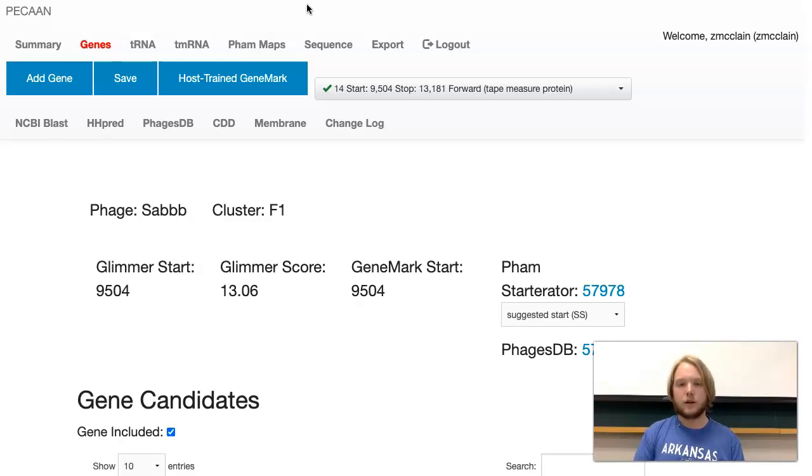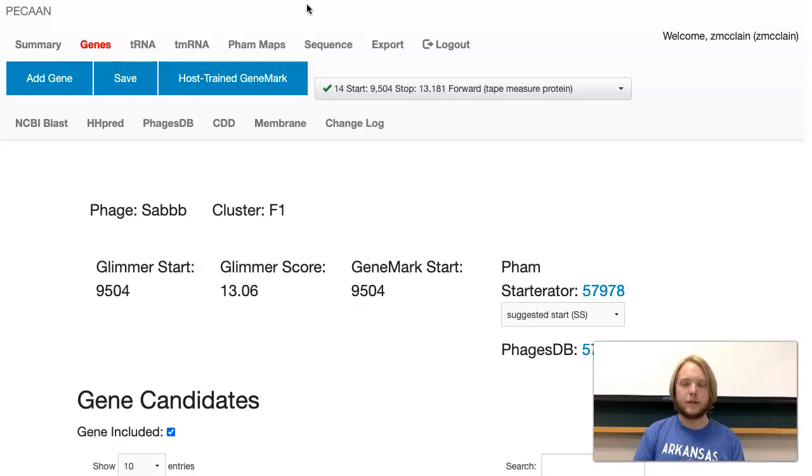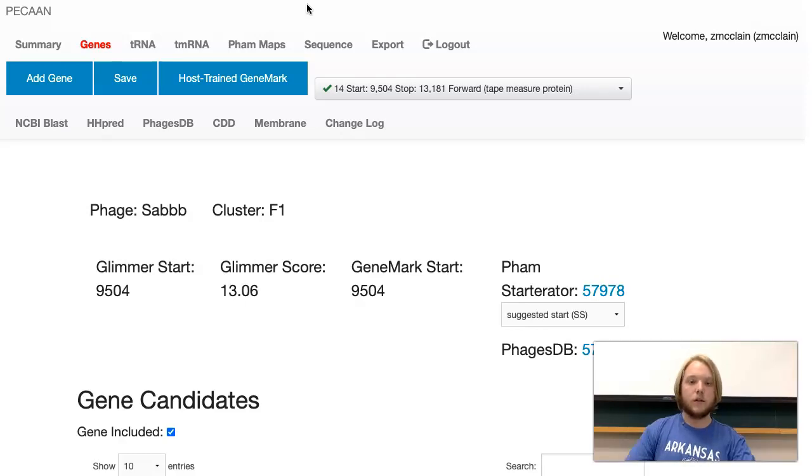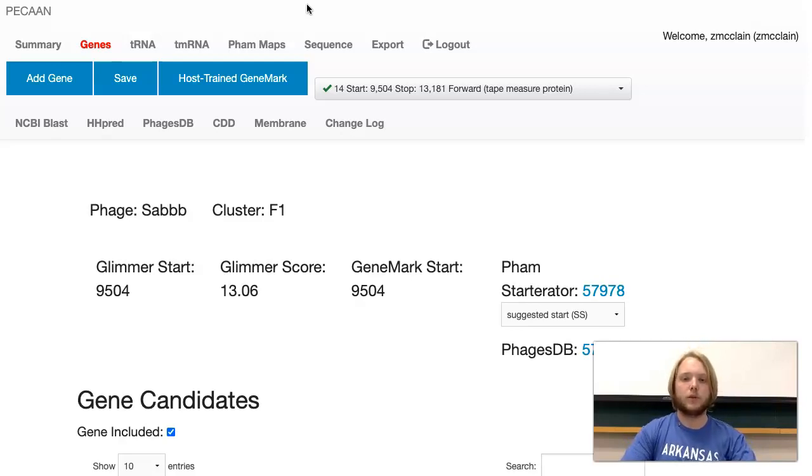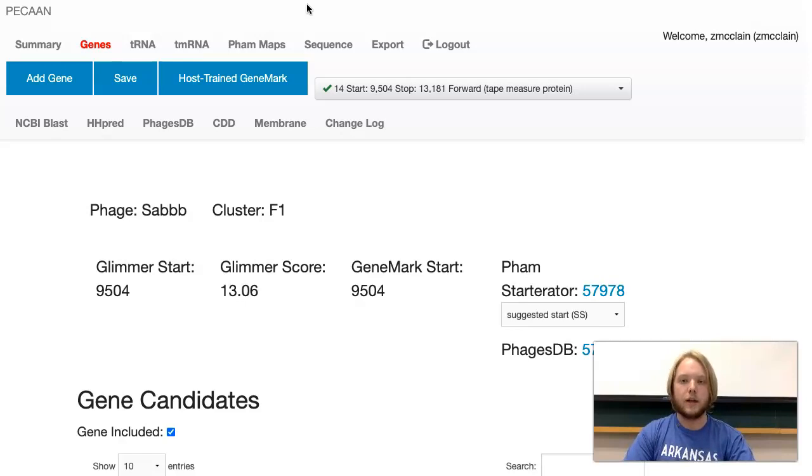Stop codons, on the other hand, only serve one function, and that is to stop a protein and cease production. There can be a lot of starts in one gene, which is why we use GeneMark to determine which start actually begins a gene and which ones are just regular amino acids.